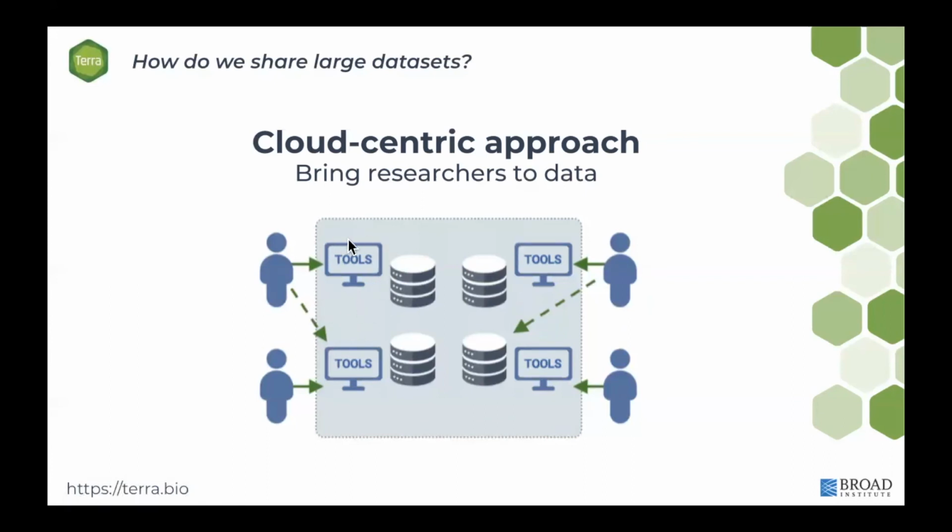The tools that we use in the cloud are shareable. They're developed in what's called Docker containers. That means that you can get reproducible results because your colleagues can use the exact same tools that you use to analyze the data. And this is cost-effective, elastic compute.